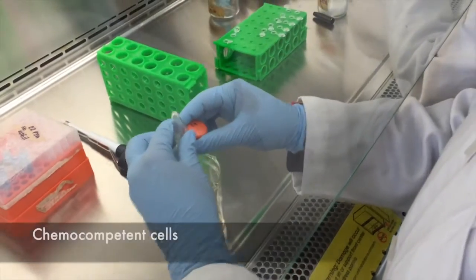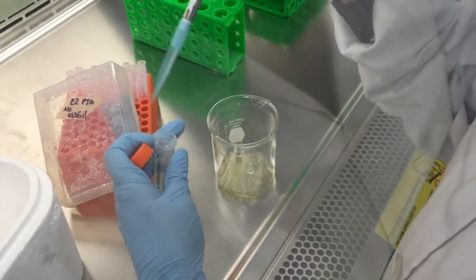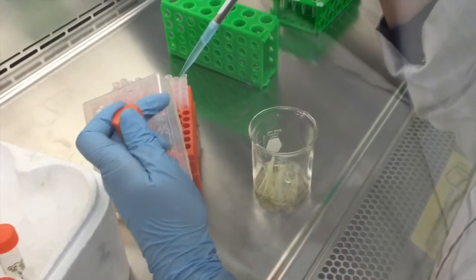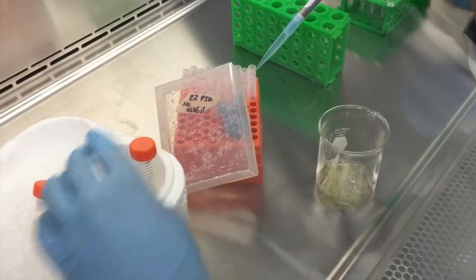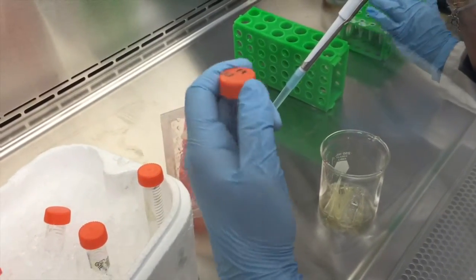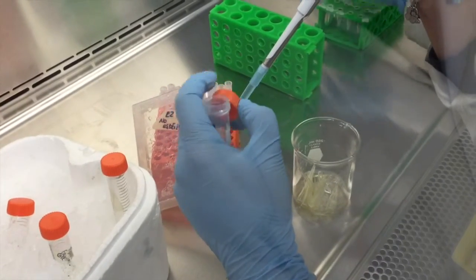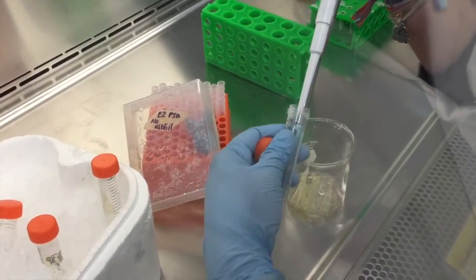After centrifuge, the supernatant was eliminated. Then 10 milliliters of calcium chloride at 0.1 molar was added in order to resuspend the pellet, and then it was incubated in ice during 10 minutes.